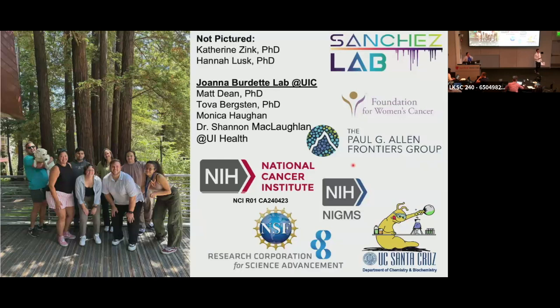Thanks, Laura. That was amazing. Also, I think you're the only person who really does these functional studies with the mass spec imaging, which is kind of your field. Is amazing. So there's no need for tissue, I think. I was wondering, because I remember you have a timsTOF flex too. For the small molecules, do you use the ion mobility to improve?